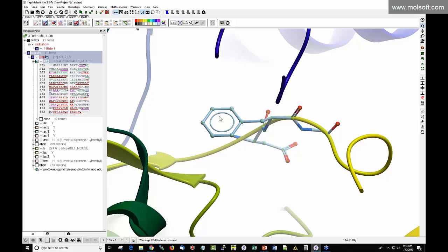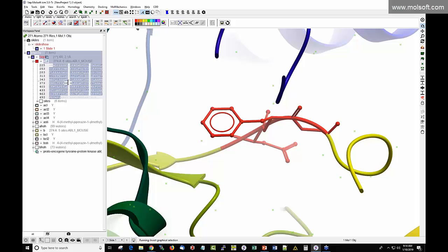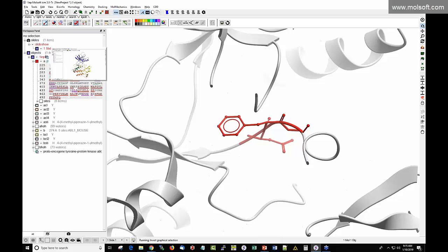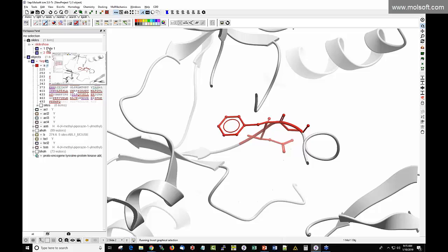Color the DFG region red using the color panel, which responds only to your current selection. To color everything outside the DFG a different color, click the invert selection button (the exclamation mark), which selects everything except the DFG. Then color that inverted selection white. Now you can make a second slide, giving you two slides you can toggle between to compare the two representations.